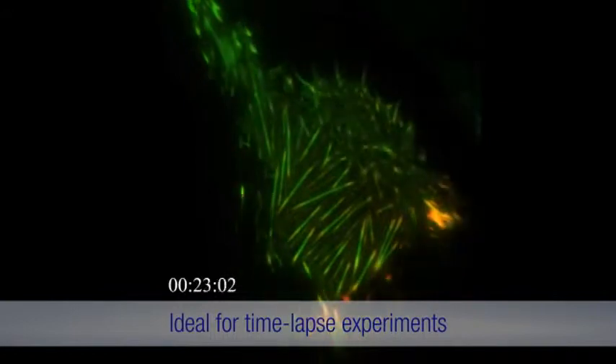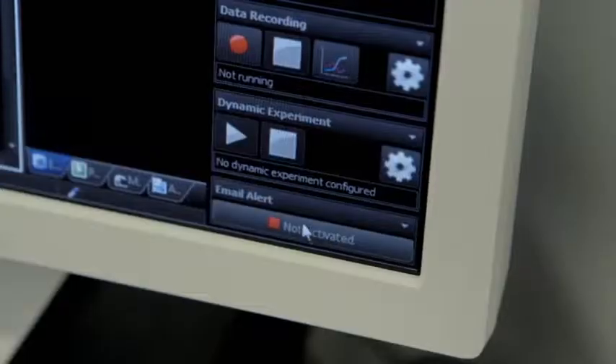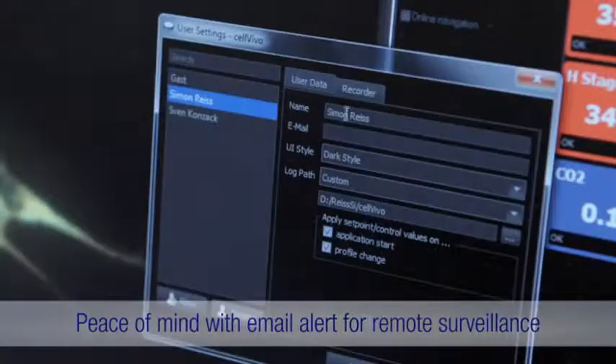Time-lapse protocols and user profiles are easily programmed, while you can be assured of optimum conditions with remote monitoring and alerts.